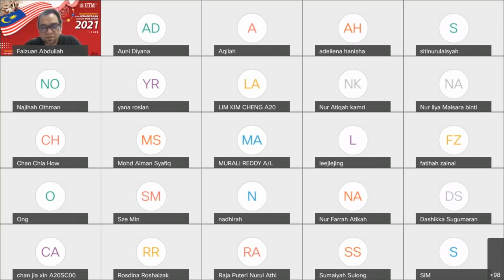It's quite messy to handle, and it consumes a lot of time, and a lot of error might occur along the analysis process, because it involves some reactions, and maybe some of our analytes, which is our metal, for previous experiments, nickel, might be left on the sample containers, and so on.